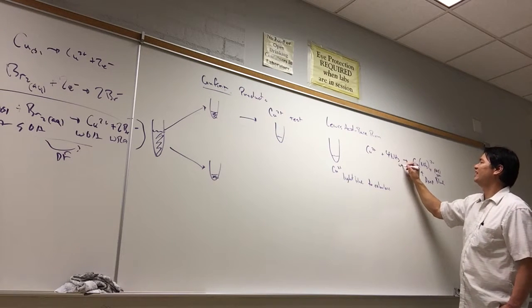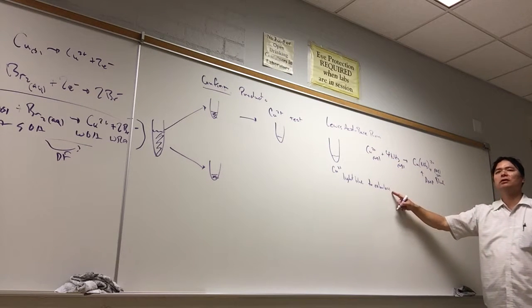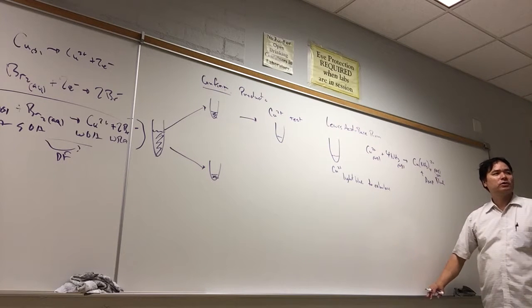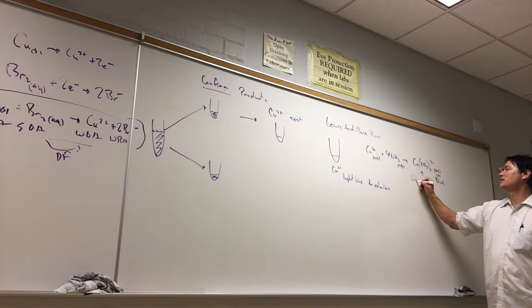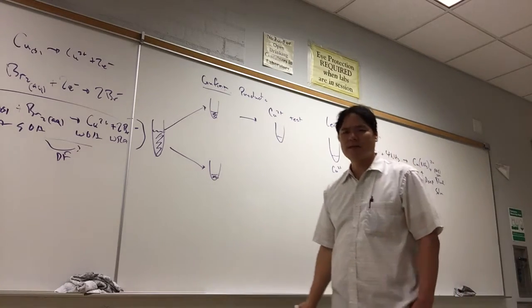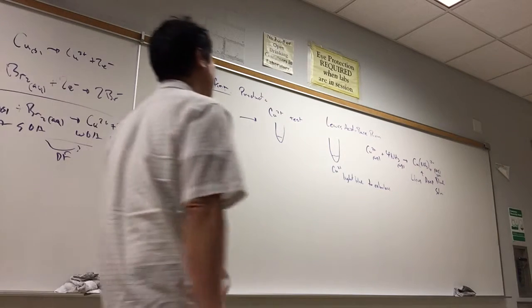It's not a precipitate. And so what happens is the color of the solution goes from light blue to a deep blue solution. It should be clear. We should not see any precipitate. So let me emphasize that by saying clear, deep blue solution. A lot of people say it precipitates, but there's no precipitate there at all. It's just like you're dyeing the solution. And so this is how we detect the presence of copper 2.